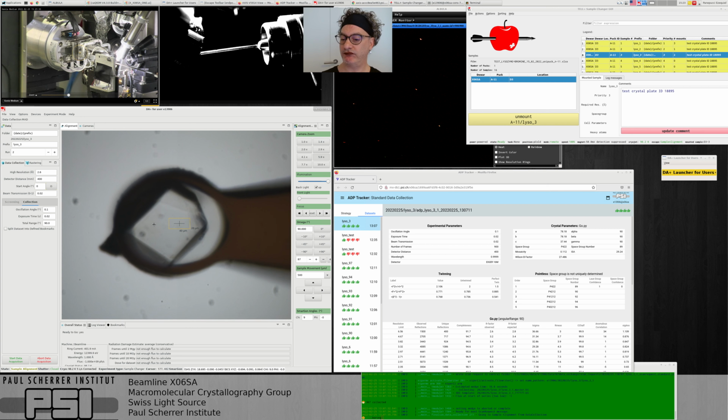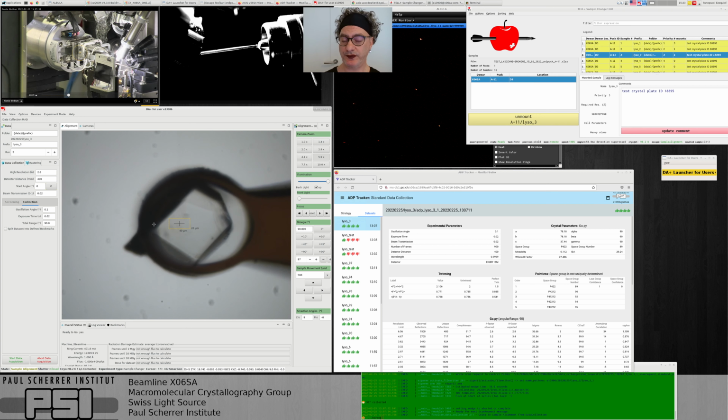They can be used for different reasons, of course. One of them is to maybe avoid a cracked part of the crystal. If the crystal has a crack, you can reorient the crystal to avoid having the beam go through the crack during data acquisition. The other usage is if you have a P1 space group and completeness is not always guaranteed, you can collect multi-angle data sets with this to increase the completeness of your data.